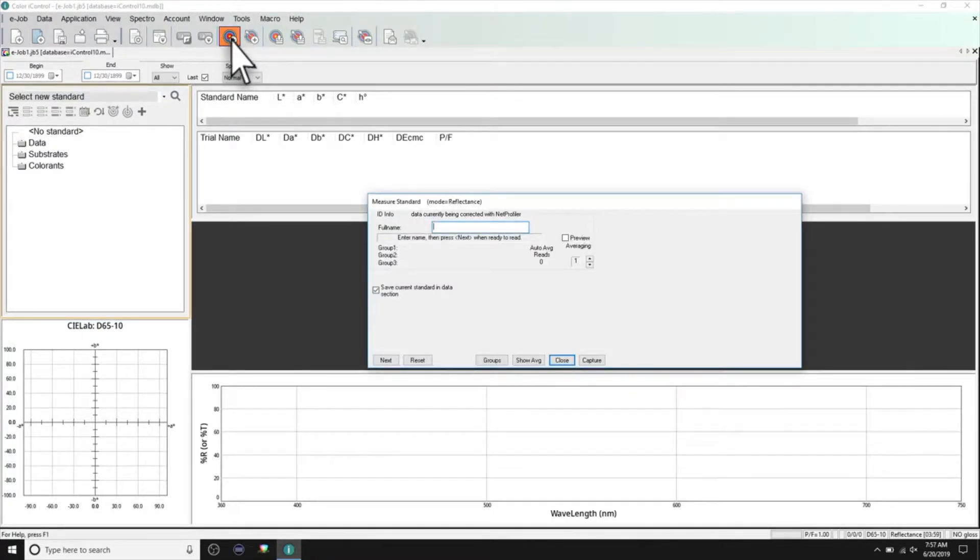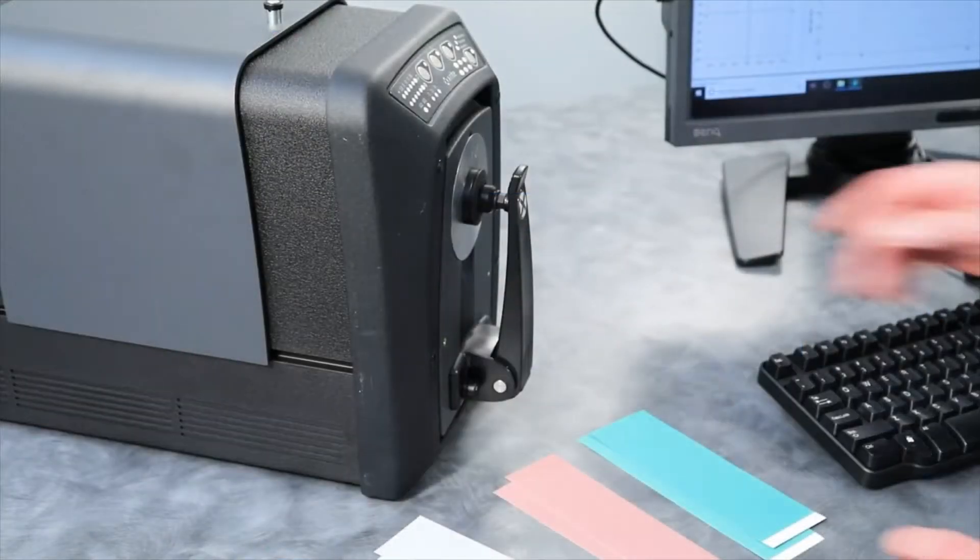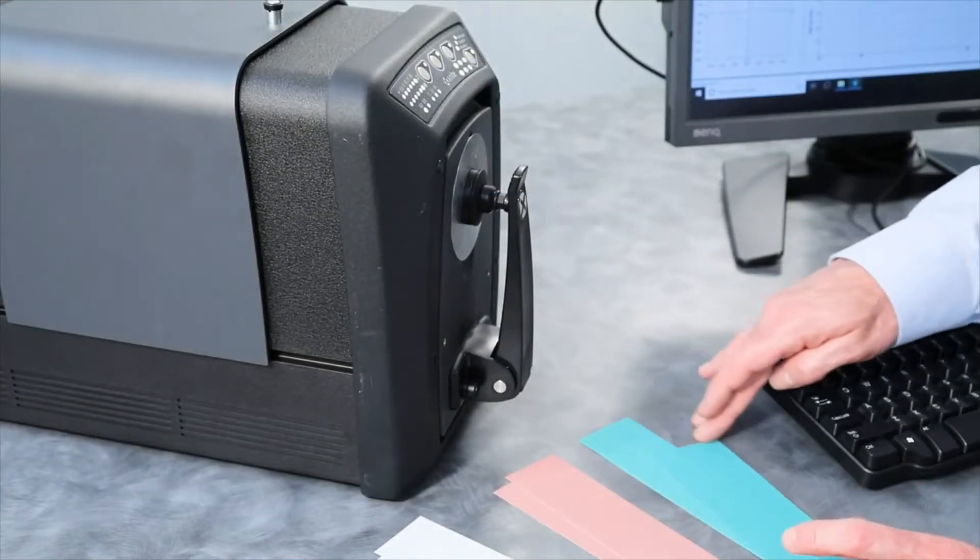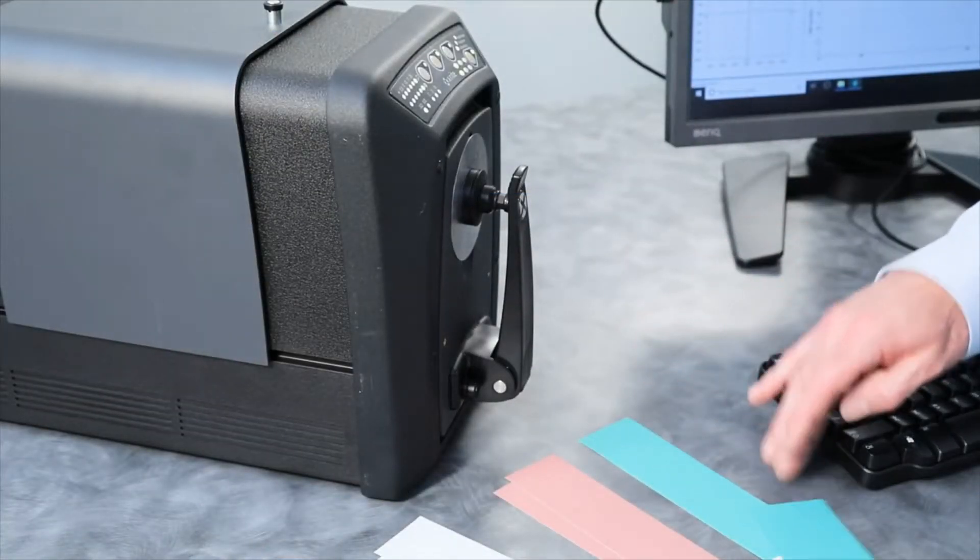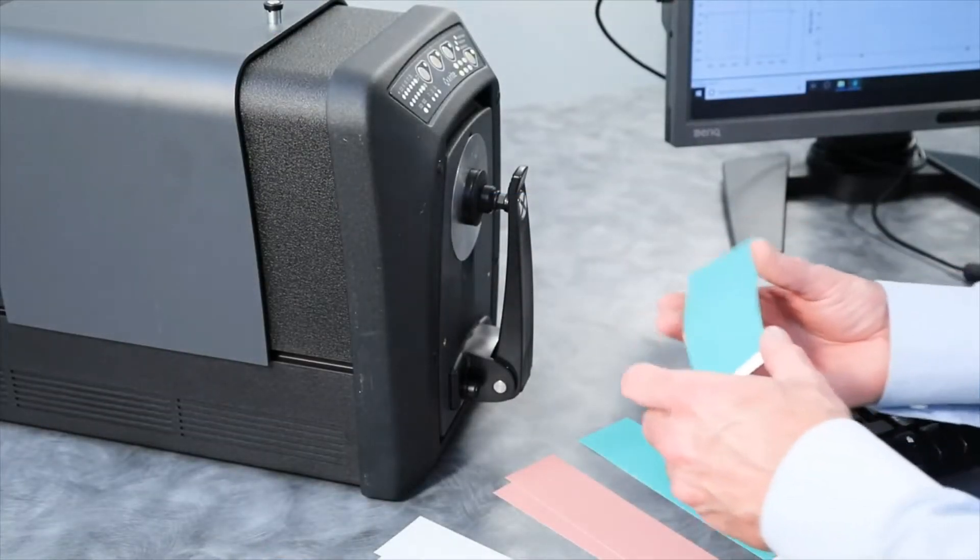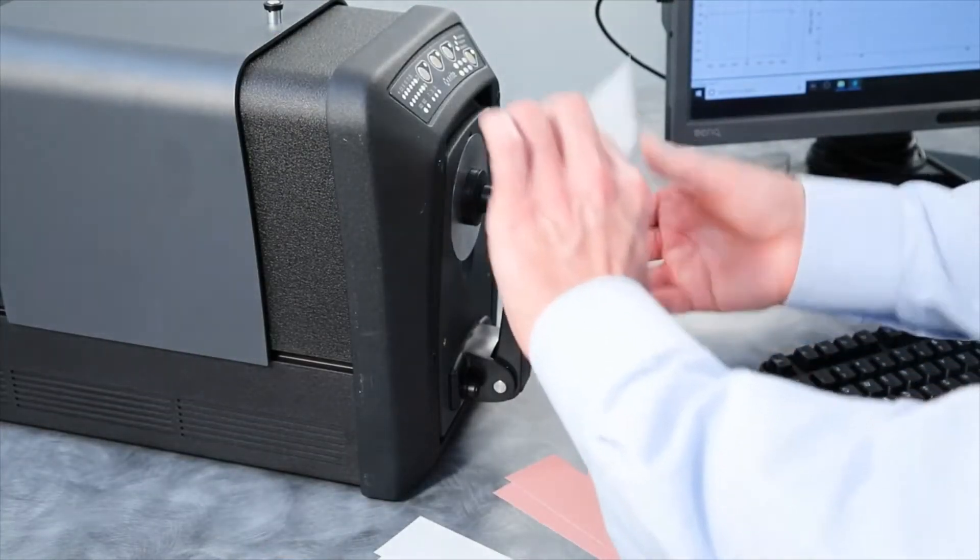Give it a name. Next, position the sample you'll be measuring between the viewport and the sample holder.